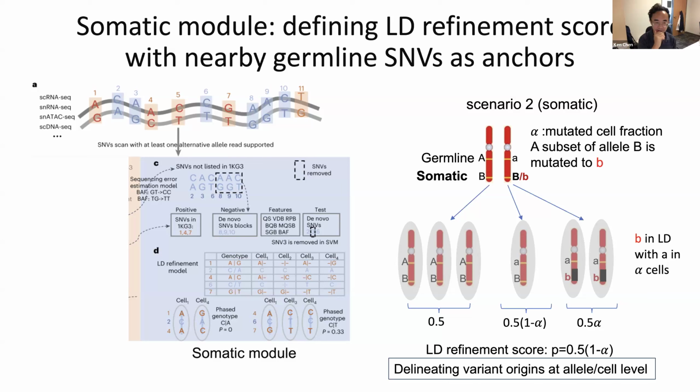So as I briefly described to you previously, somatic mutation calling is much harder. We basically focused on the regions where there's a lot more coverage. I think we had a cutoff, I don't remember exactly, it's potentially 400 reads. Yeah, 400 reads. If the whole data set has 400 reads covering a particular location, then we try to examine the potential of having either a de novo germline variant not existing in the 1,000 Genomes or actually a somatic mutation at those types of locations. Of course, the 400 is distributed into different numbers of cells, which we will be able to resolve at a later stage. And we do different QC, quality control.